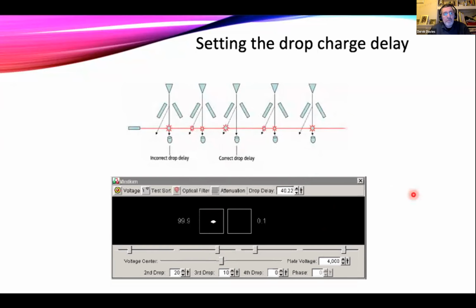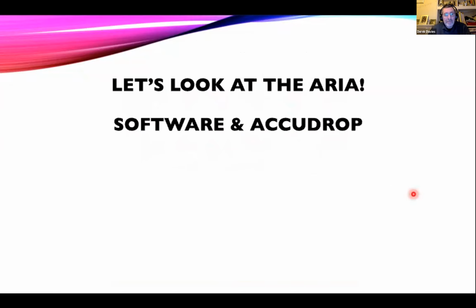So that's a little overview of what we're now going to see in practice. So I'm going to hand over to Kathy at this point on the actual machine, and we're going to actually look at that setup.